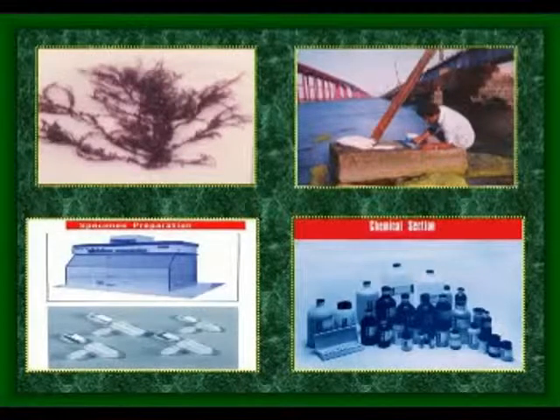Then fixation by means of glutaraldehyde. There are many different types of fixatives available, but in the case of electron microscopic studies, it is exclusively glutaraldehyde. Generally 2% glutaraldehyde is used. It is available commercially as an aqueous saturated solution. So how to prepare the primary fixative?